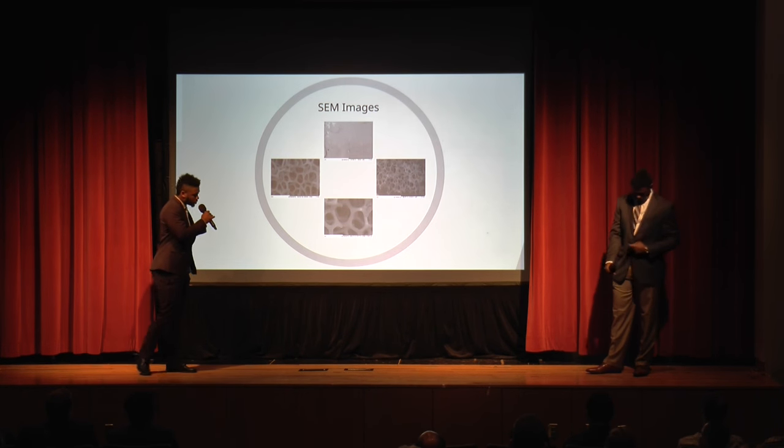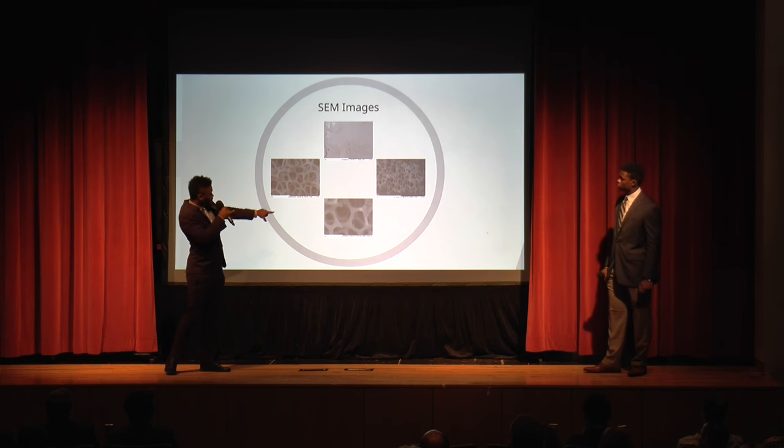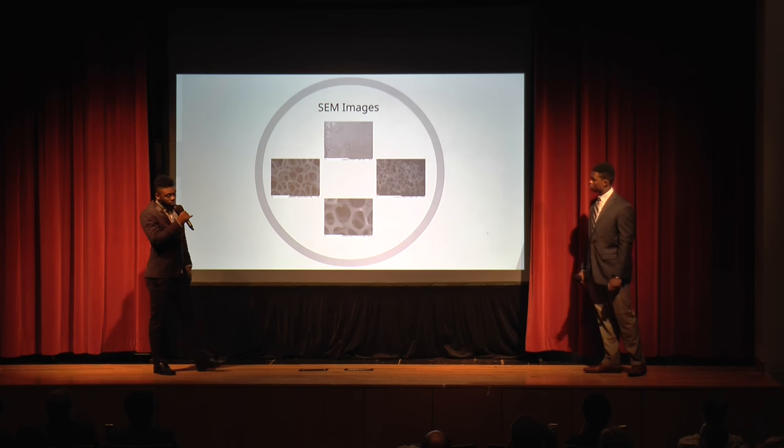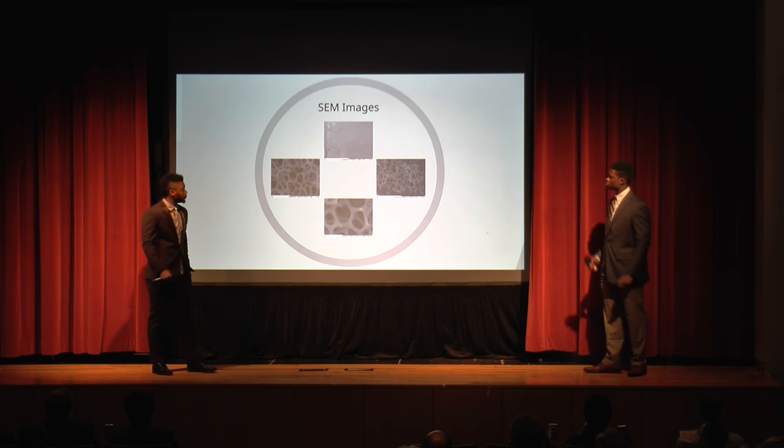These are SEM images of the materials we used to drop test on. These three right here are the polyurethane that we shared with MT Bioscience, and the top one is the Sorbothane.